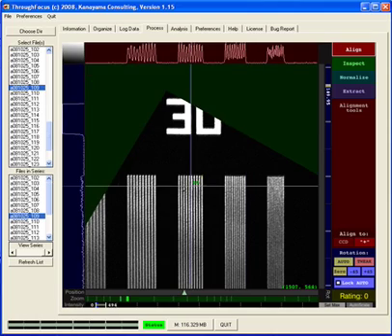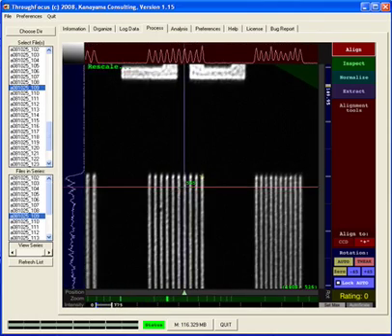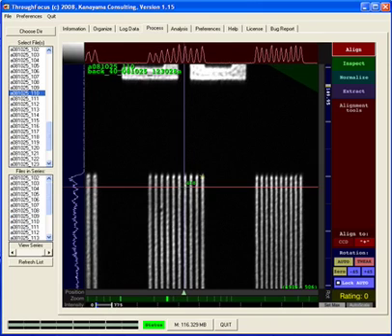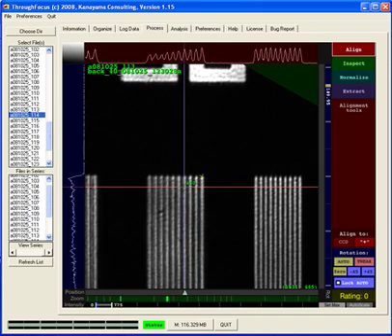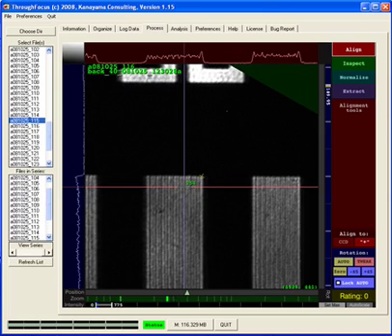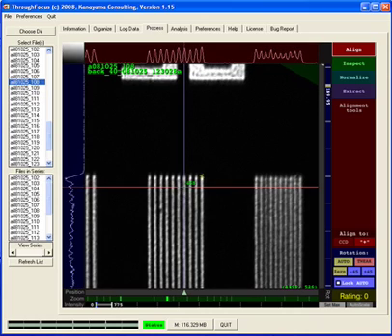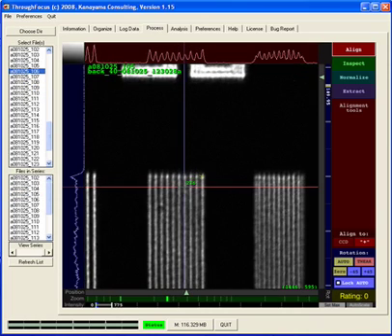Put the crosshair right there and zoom in and double click to get a good intensity. Now, using the right and left arrow keys, you can really see how the lines change as we go through focus. Okay, now it's time to get the data out of the program.